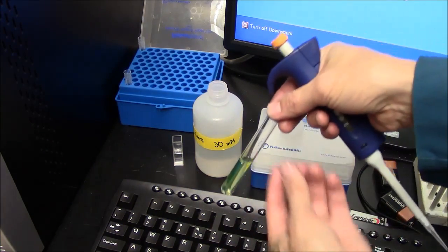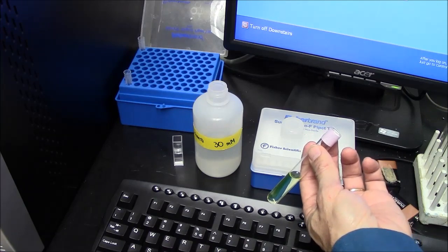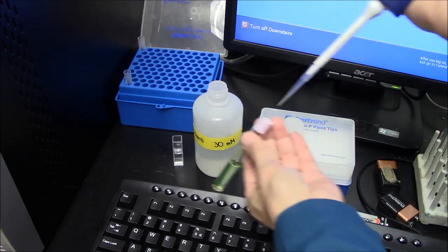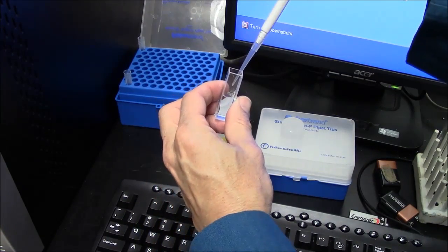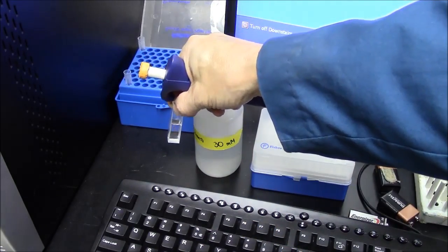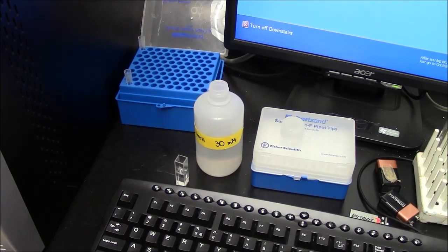This fluorescein is at a concentration of 5 micromolar, and I want to dilute that to 0.1 micromolar. That's 100 nanomolar. So that requires 40 microliters of my fluorescein. To my eye, this is a completely transparent solution. I don't see any color in it. The machine, however, will be able to detect the fluorescence of 100 nanomolar fluorescein.